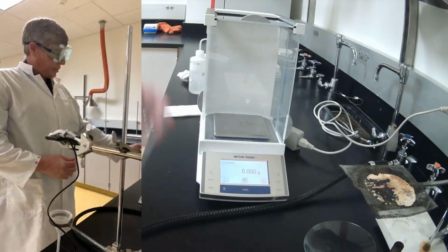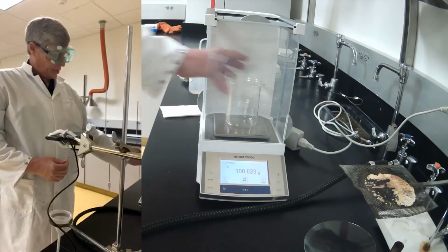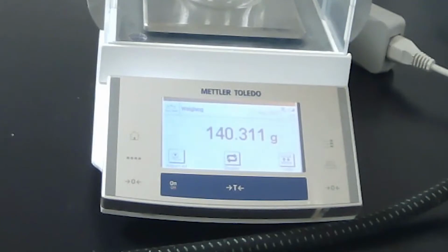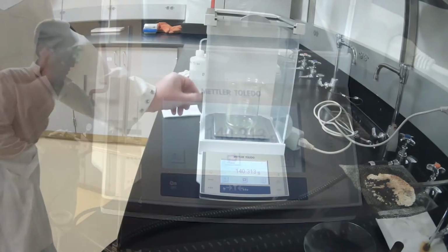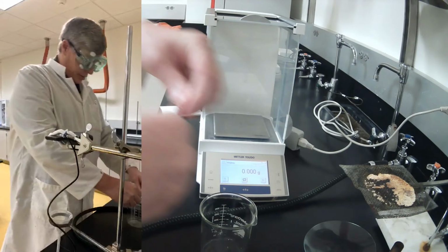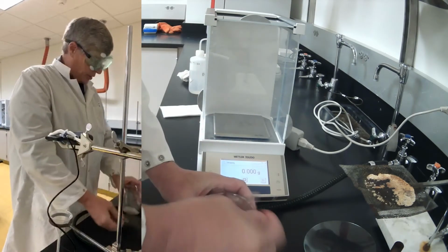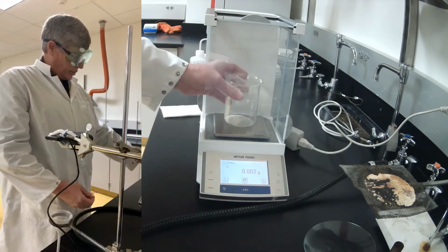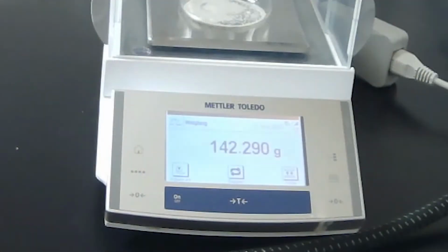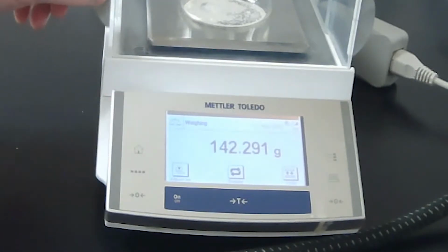We're first going to weigh a beaker empty. This is your large beaker. Very carefully, I'm going to pause for a second. Record the mass. Alright. Then we're going to take all of our unknown, this unknown number 18, pour it into our beaker that we just weighed, and then weigh it again. The difference of the 2 weights, very carefully record that mass, and that will be the weight of our starting unknown material.